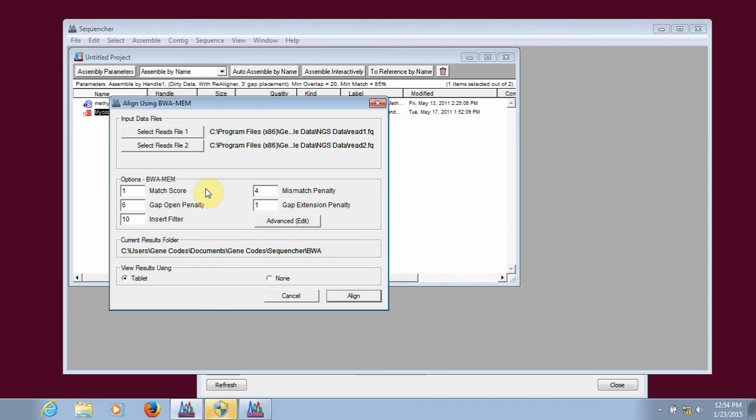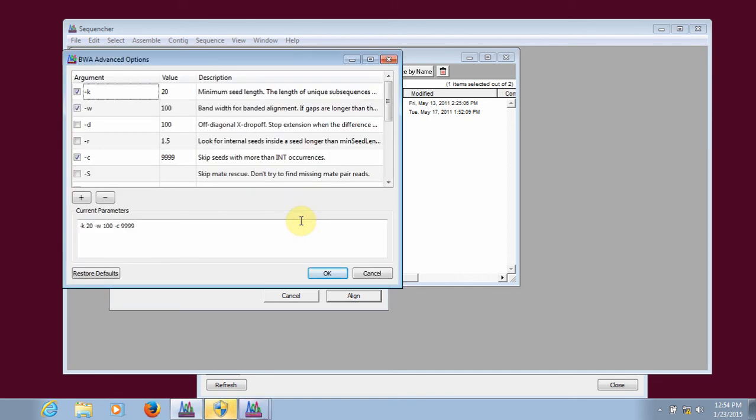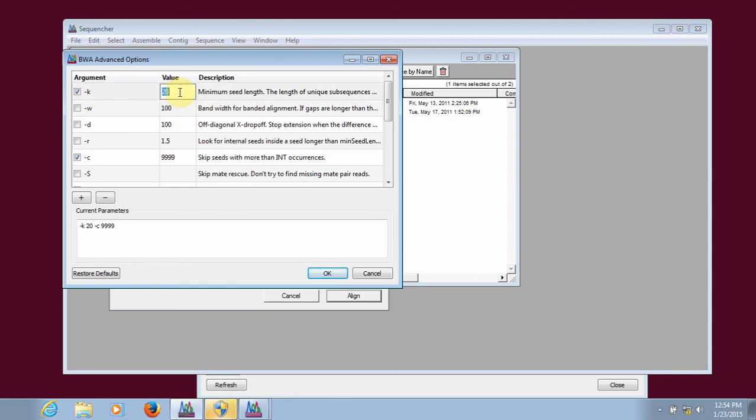You can change some of the most frequently used options for BWA right here in the window. You can also click on the Advanced Edit button to easily change some of the command line arguments. You simply check or uncheck the box next to them and change the values to whatever is appropriate for your alignment. And then you can see those command line arguments down here in this box. When you're done with that, click OK.